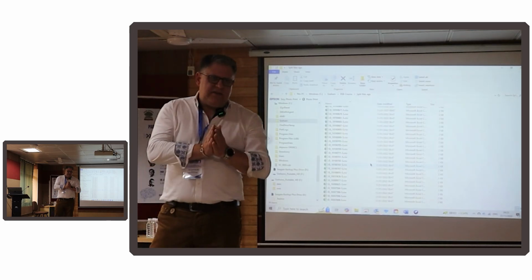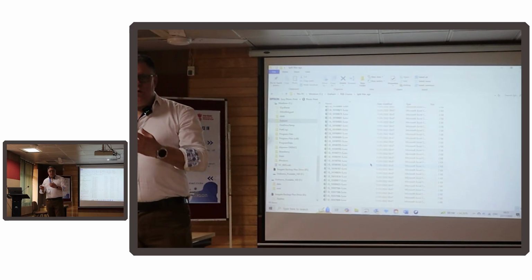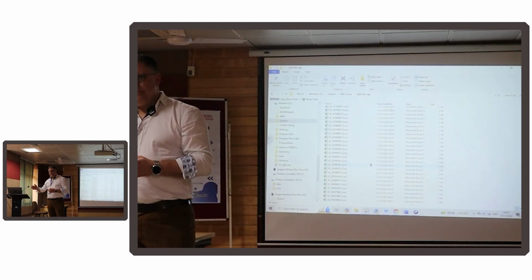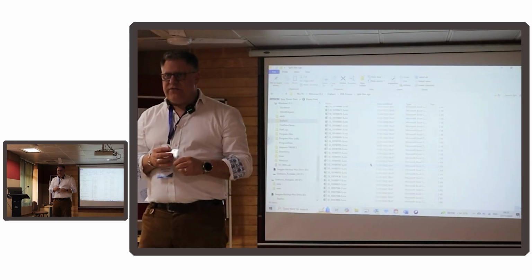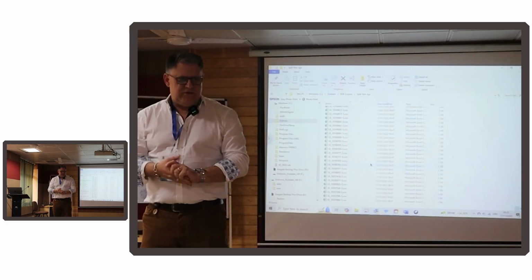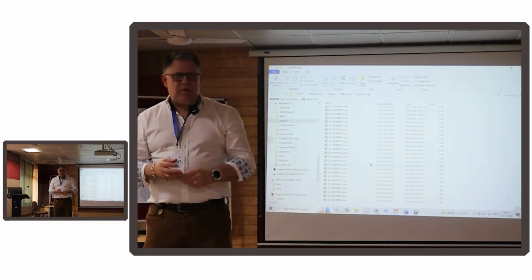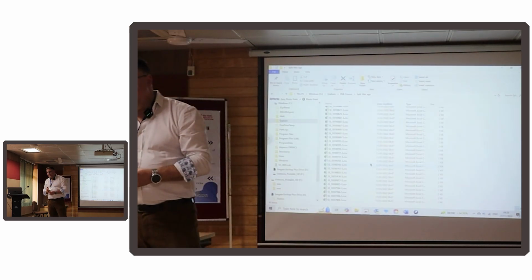By splitting the data into one file per gene, it's more efficient. It's not loading the whole data set into memory. It's just running one data set at a time. If you have any command of R, it's actually quite easy to split that up. You could, if you have plenty of time on your hands, split it up manually, but by getting R to literally extract the columns into files, you could probably do that with 3 lines of code. You could probably get ChatGPT even to write you the code to do that.